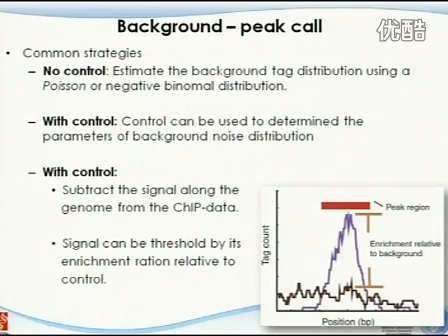So if you have 100 million windows across the genome, and only, let's say, 10,000 of them are real signal regions, those are only representing a very small proportion of the overall. So you still have enough information to get you through the rest of the background noise.